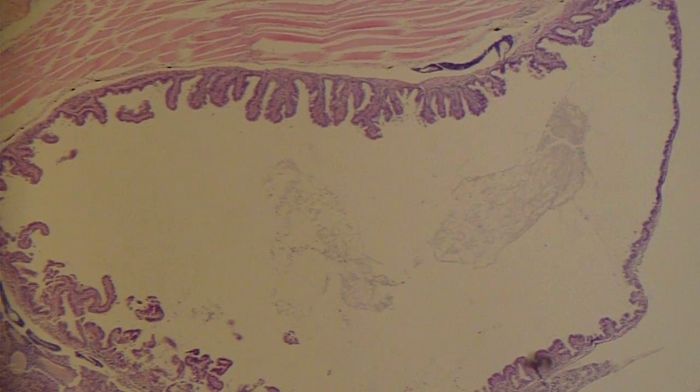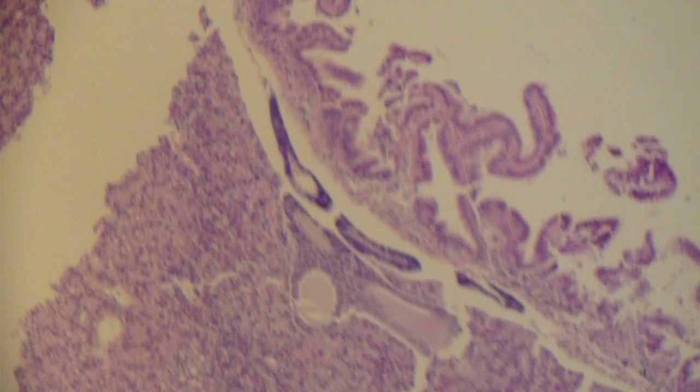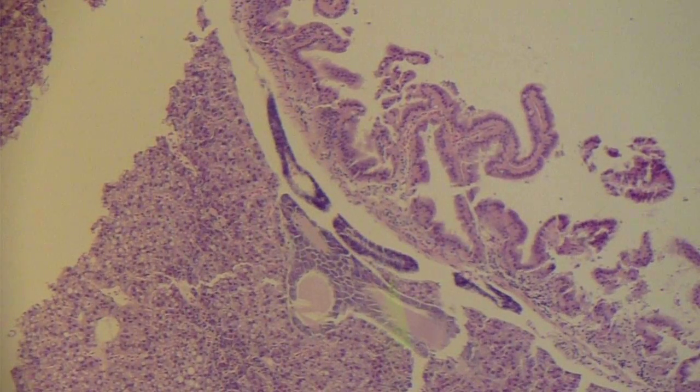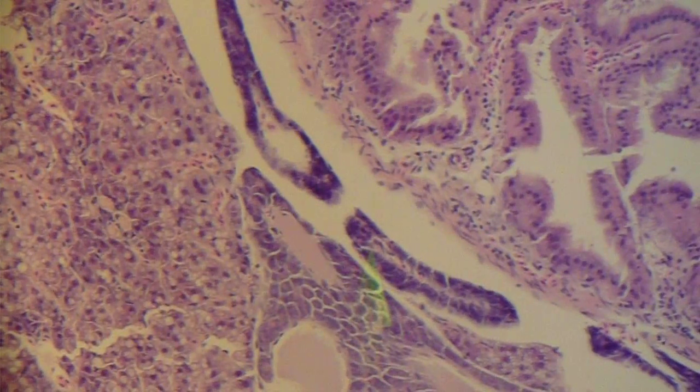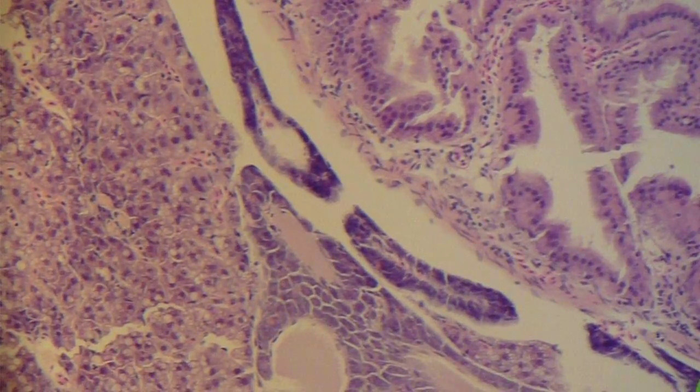We'll zoom closer into the pancreas. If we look at the pancreas here, the darker blue cells — we'll zoom in a bit closer again — and you'll see that they actually do not contain any pink granules, which are the zymogen granules. This is a common finding in fish that have not eaten in quite a while.